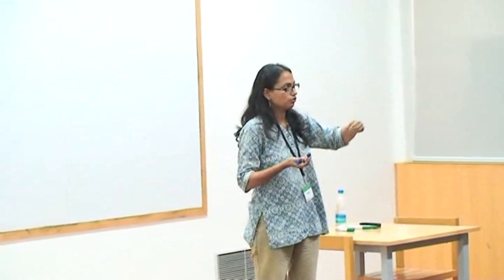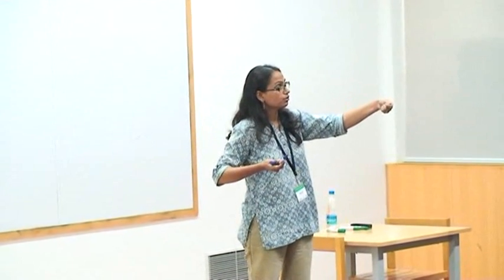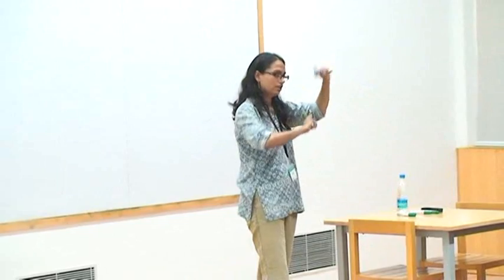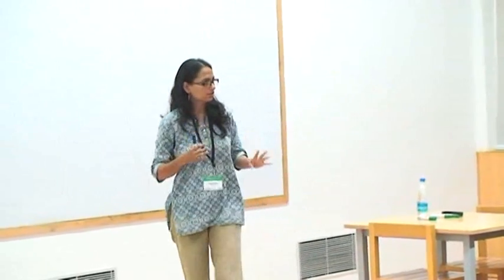Now, coming back to ligand density, you can do your fibronectin coating, or whatever ligand you want to coat, and then strain it. Because the strain is non-uniform, the ligand-to-ligand spacing will now be non-uniform, so you have a gradient of ligand. Then you can put your cells. If you just want to create gradients, you can use this whole concept. You can strain, have a gradient, and pull it back if you want the reverse. So these are other things that you can do. So why did you strain this?